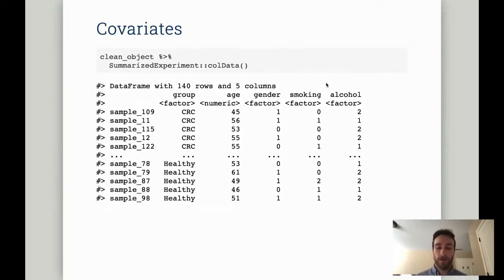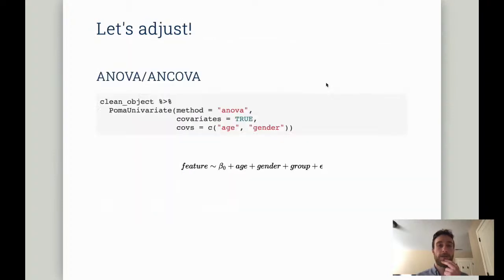But I know that coding that in R can sometimes be tricky or difficult, but we can do that in a very easy way, for example, using this software. Here, again, I know I'm repeating this a lot of times, but I think it's important: the input is the same input. It's a SummarizedExperiment object.